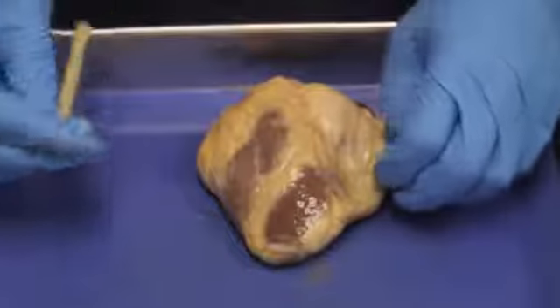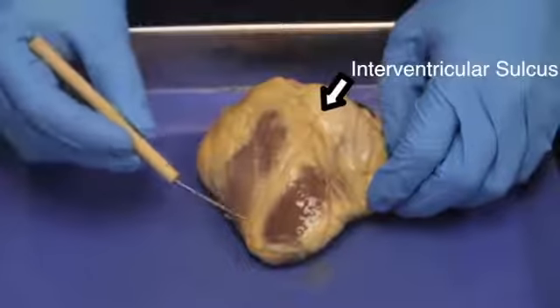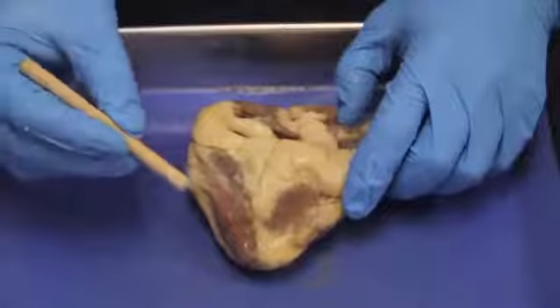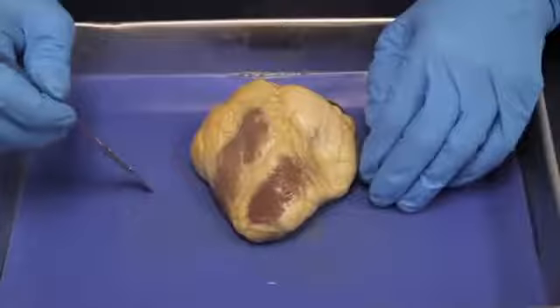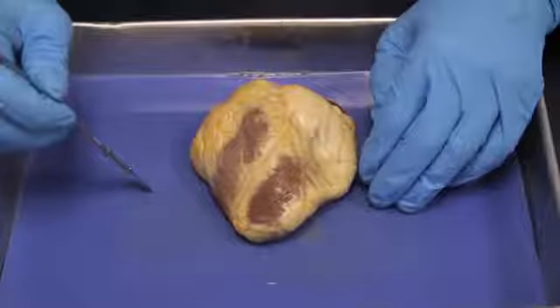Okay, some other external features. We want to find our interventricular sulcus, which is this line here. And on the other side, we also have a sulcus, which is part of that same system. You can see a lot of fat that's around this well-fed, corn-fed sheep. Now that you've identified all the external features, you're ready to cut.